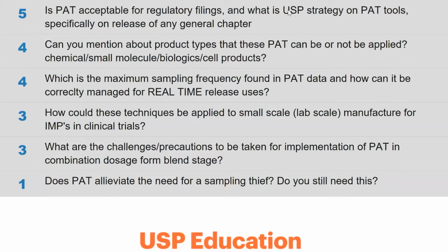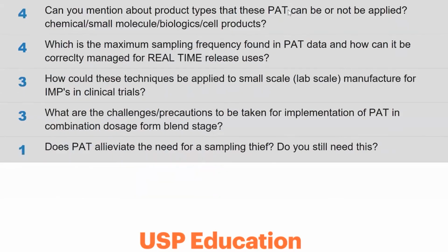In fact, near IR spectroscopy, which is really a workhorse, actually has its own guideline on submitting near IR data for process analytical technology. And it goes through exactly what you need to submit and how to submit it, what to do. It's a great guideline.